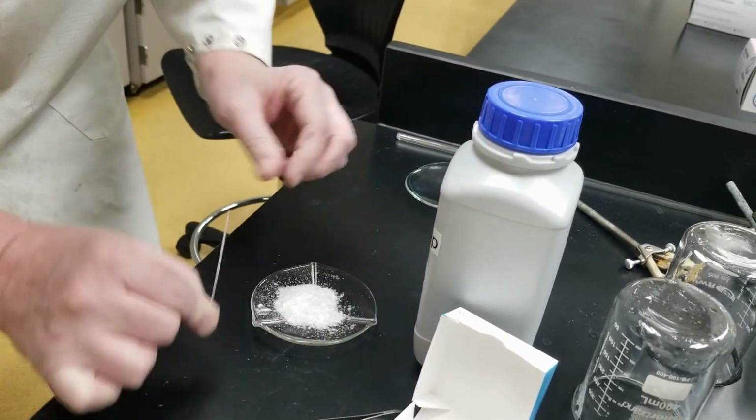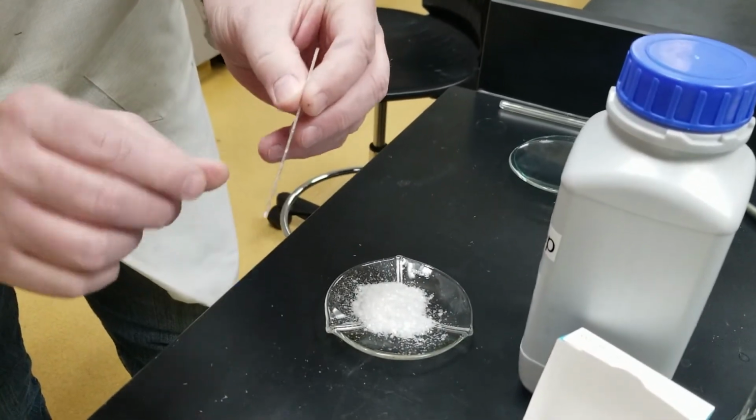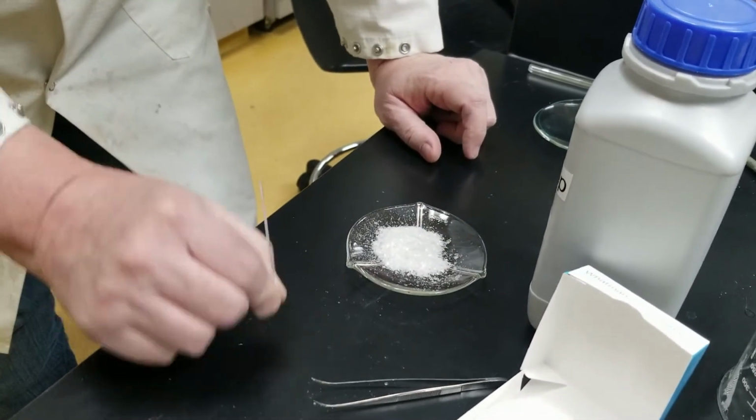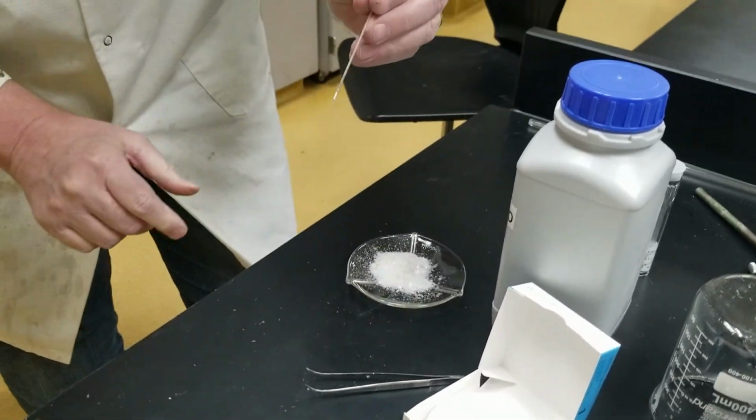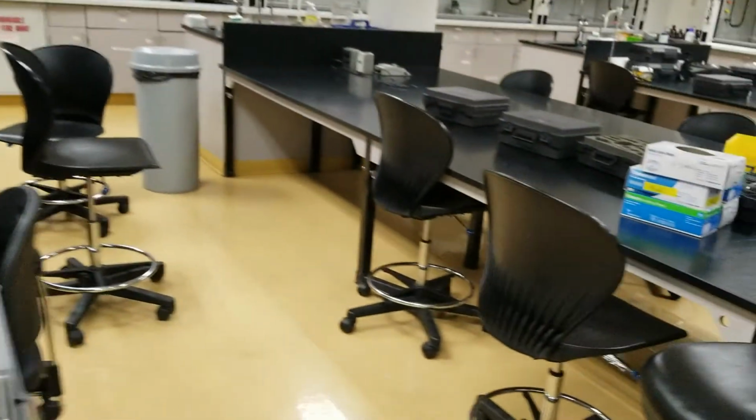We're going to pack this in a second, but I don't think we even need to. It basically went down pretty well. This is old-fashioned packing. Yep, that looks pretty good. Let's go take a melting point. All right, so we're just going to go ahead and set up over here.